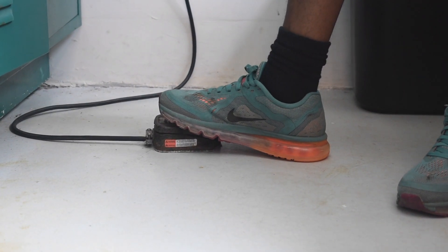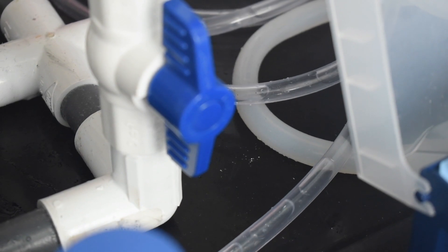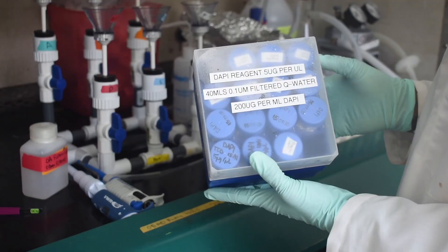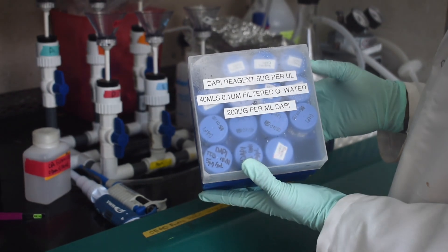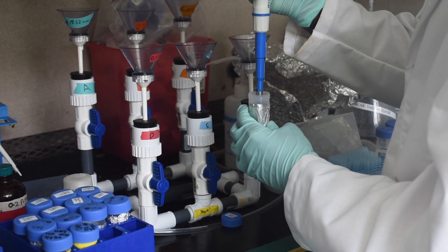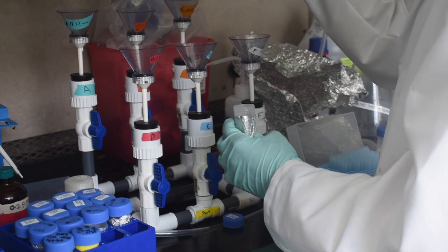We filter the bacteria through and then we add 1 mil of a 5 nanogram per microliter DAPI solution onto the filter and we let it stain for 3 minutes.